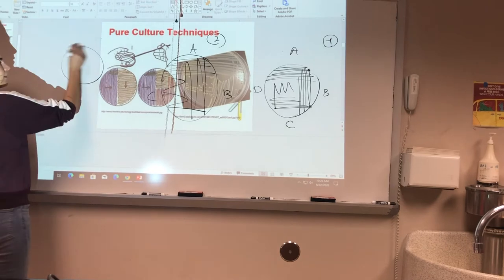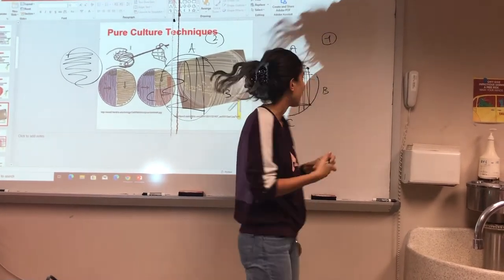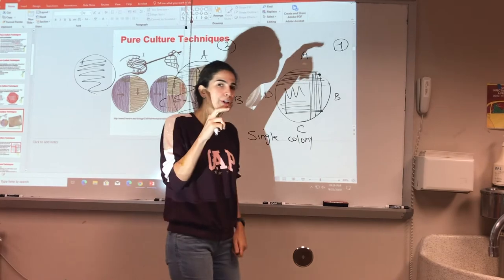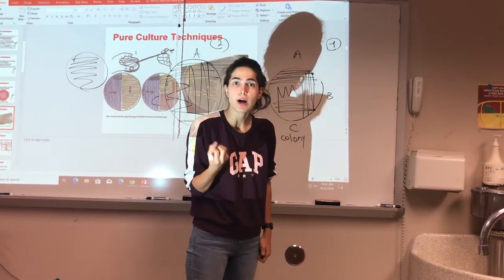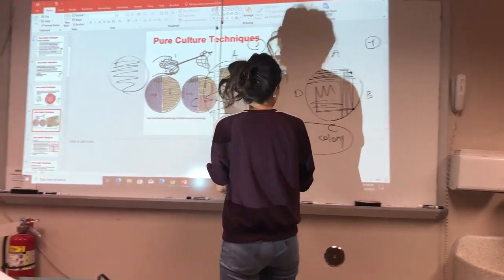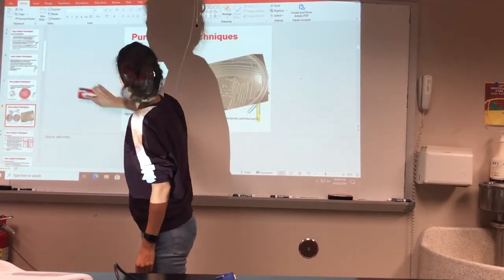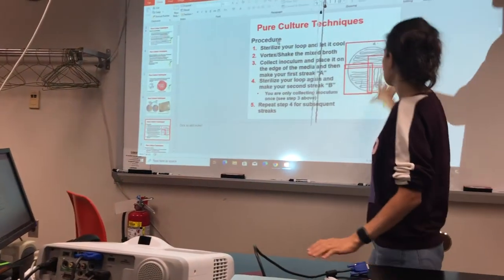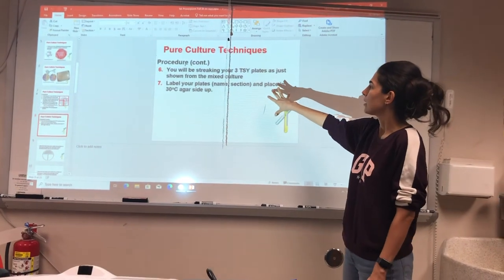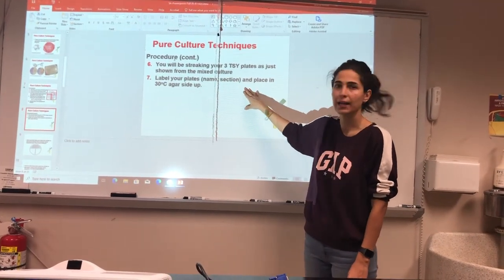The reason we do it this way is that we want to get a single colony. This is really important — to get a single colony. Otherwise, if you culture two different bacteria and you want to get the pure culture, which means one type of colony, you need to have the single colony. Today we are going to streak just one plate from the mixed culture.